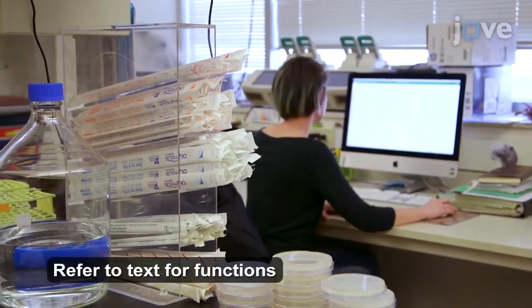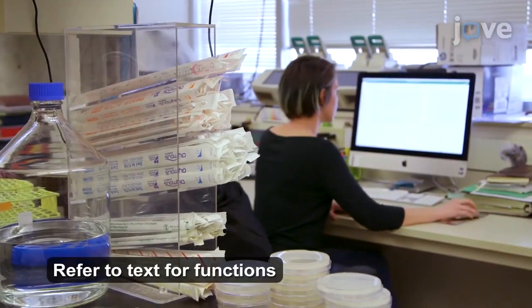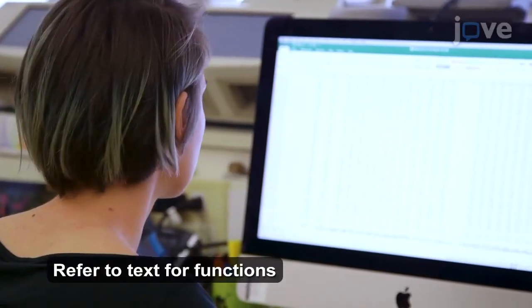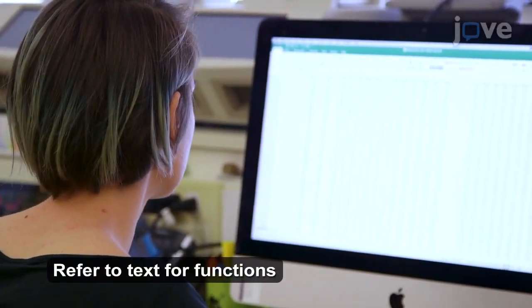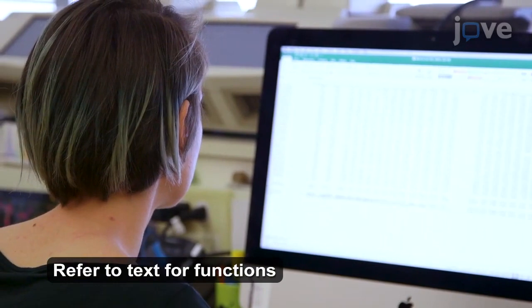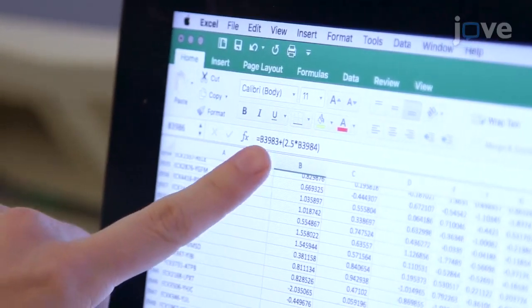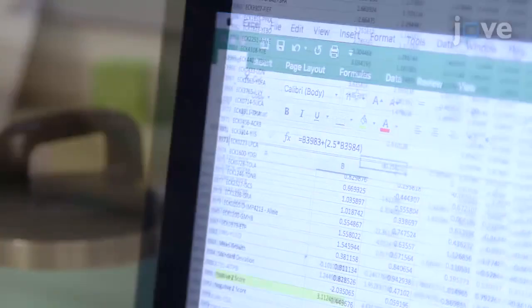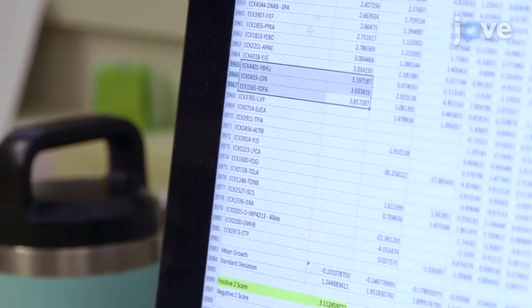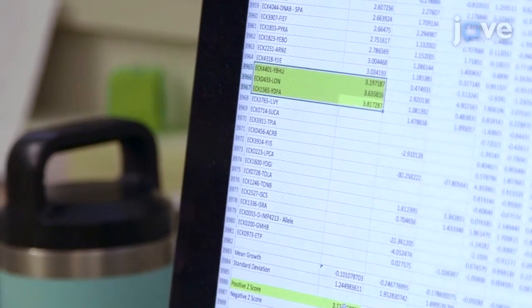Use a standard spreadsheet to calculate the mean growth score and standard deviation for all the mutants in the presence of a particular concentration of the small molecule added. Then calculate the Z-scores for each of the small molecule concentrations and highlight the gene mutants with significant Z-scores.